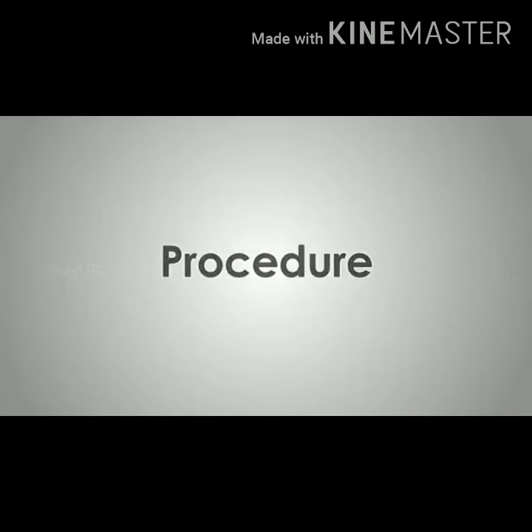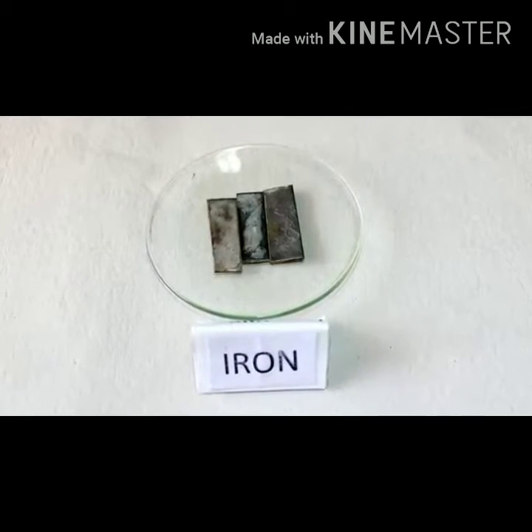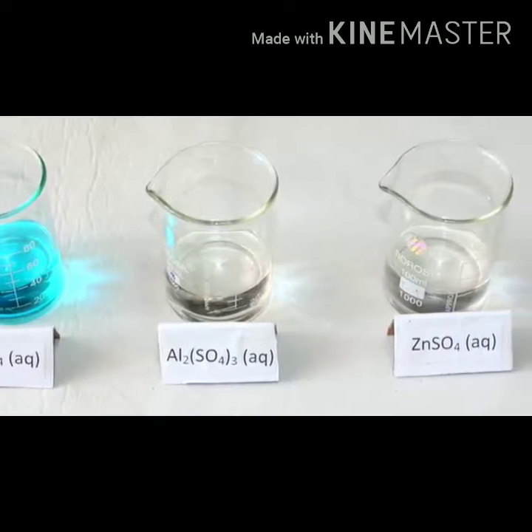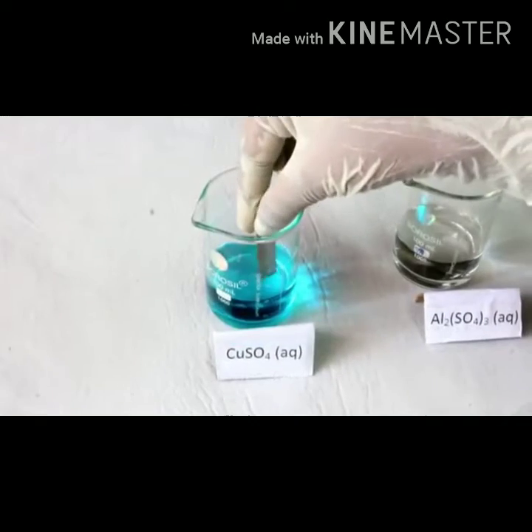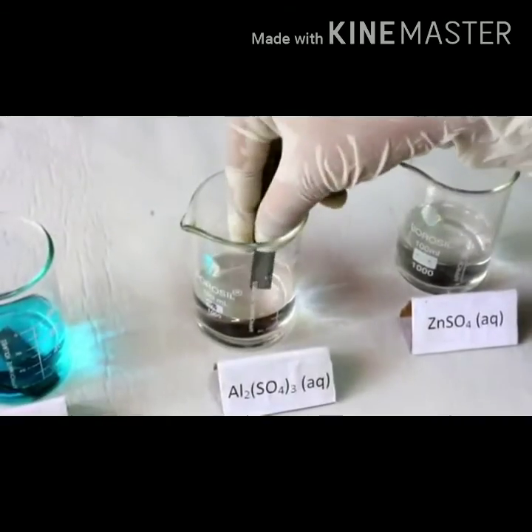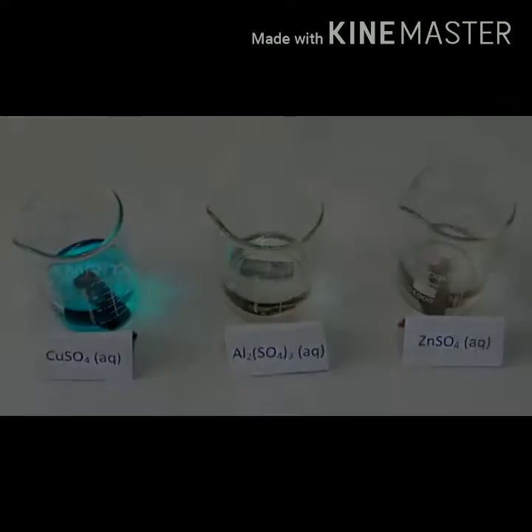Procedure: To test the reactivity of iron in the solution of copper sulfate, zinc sulfate and aluminium sulfate, take small pieces of iron and put them into the beakers containing copper sulfate, zinc sulfate and aluminium sulfate solutions. Leave the beakers undisturbed for 1 day.